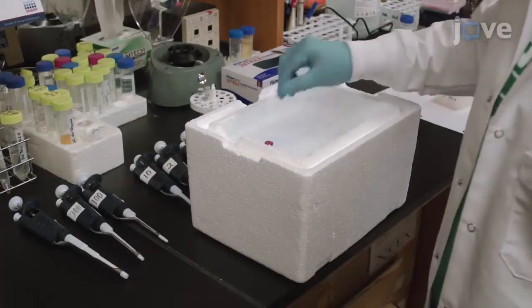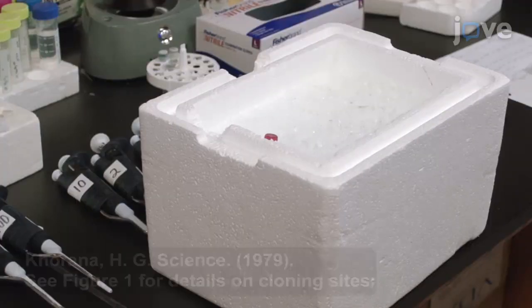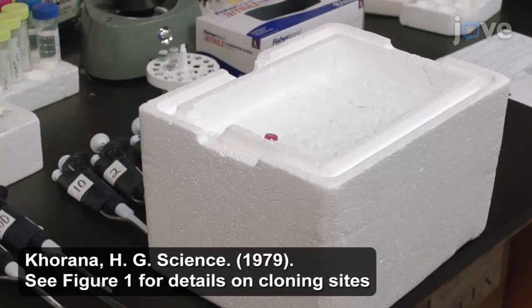First, synthesize a DNA fragment containing a 5' BGL2 cutting site, the secretion signal sequence of interest, and a multi-cloning site as outlined in the text protocol.